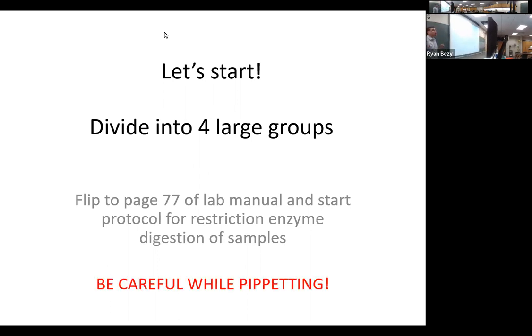One thing I want to make sure though, be very, very careful when pipetting today. You are pipetting much smaller volumes, like 10, 12 microliters, than you guys have pipetted in the past. What that means is you're going to press down on your plungers, your pipettes, and it's barely going to move. And that is the way it's supposed to be. It's press and you're already there, basically.